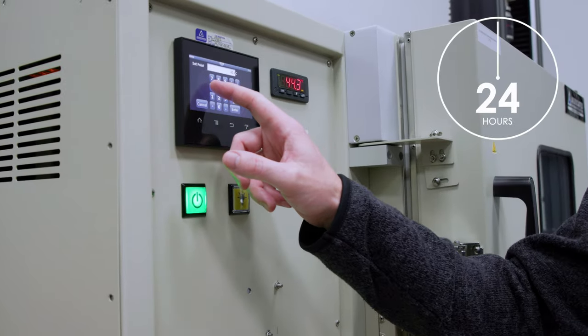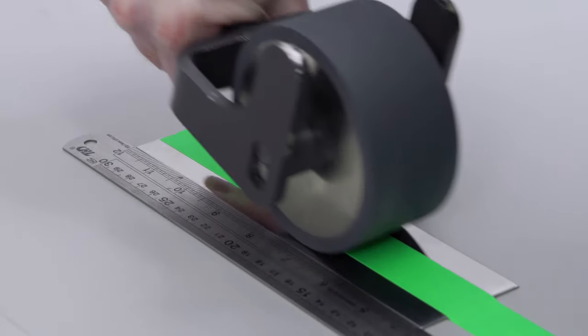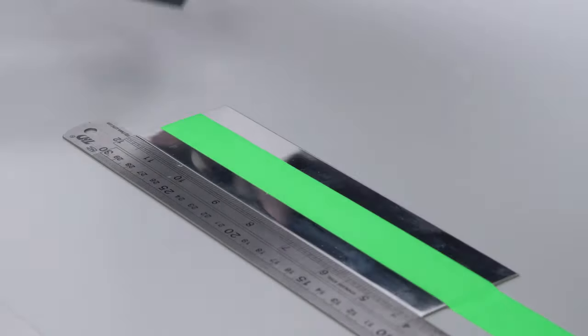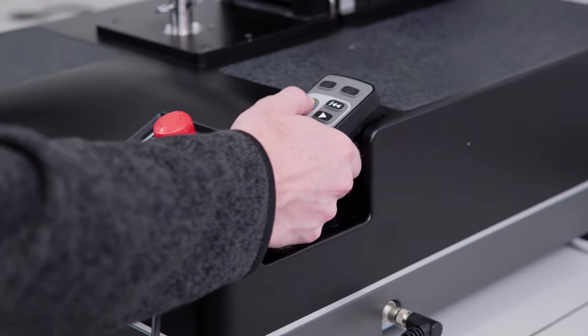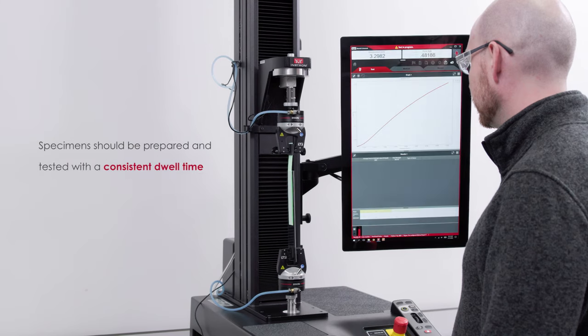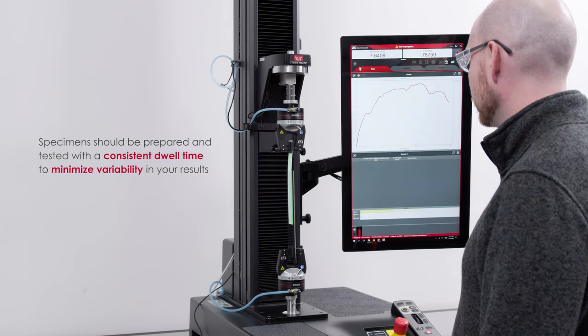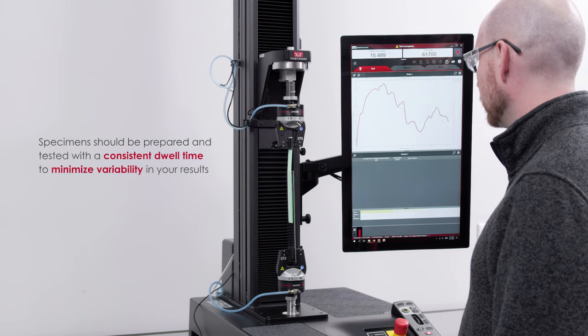Specimens must be conditioned for at least 24 hours and then applied to a stainless steel substrate. Because adhesion properties increase over time, specimens should be prepared and tested with a consistent dwell time to minimize variability in your results.